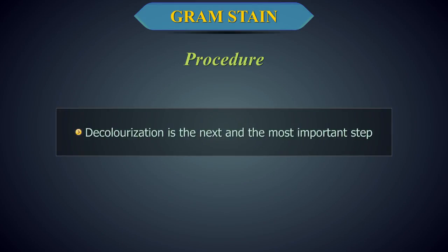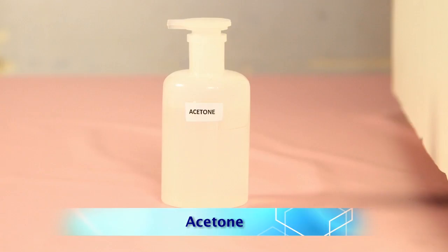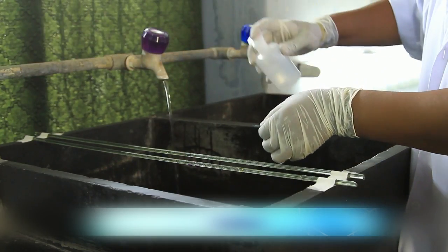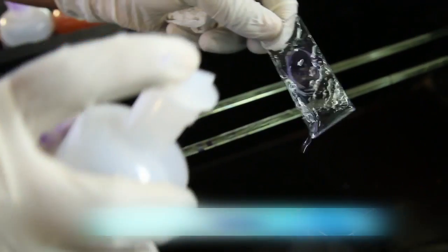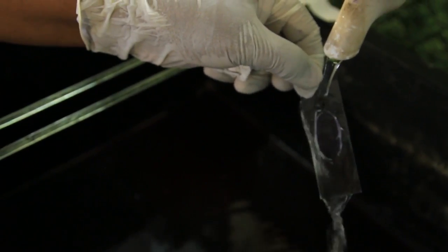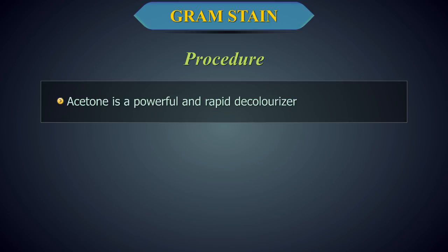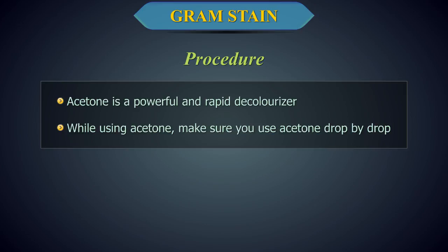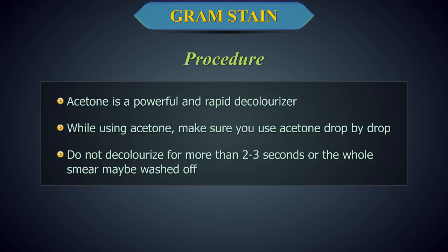Decolorization is the next and the most important step. Decolorize using 95% ethyl alcohol or acetone. Tilt the slide slightly and apply the alcohol drop by drop for 5 to 10 seconds until the alcohol almost runs clear. Immediately rinse with water. Acetone is a powerful and rapid decolorizer. While using acetone, make sure to use acetone drop by drop. Do not decolorize for more than 2-3 seconds or the whole smear may be washed off.